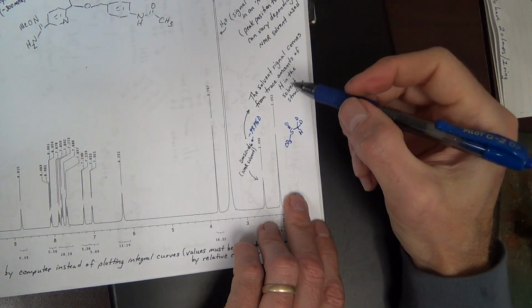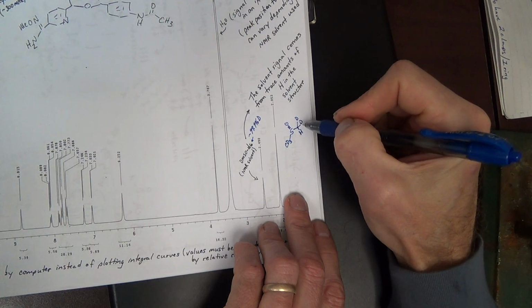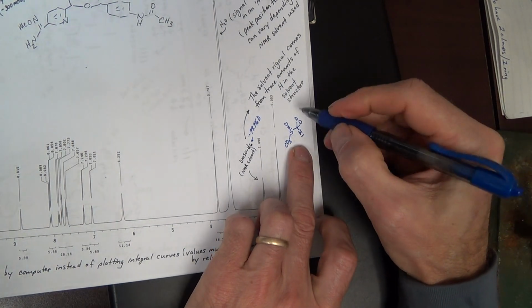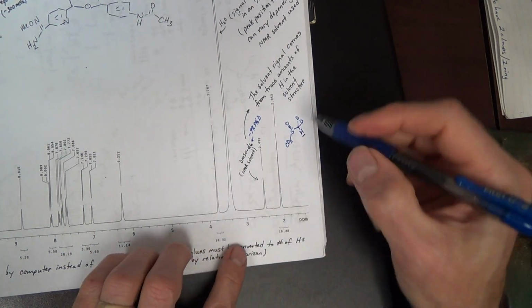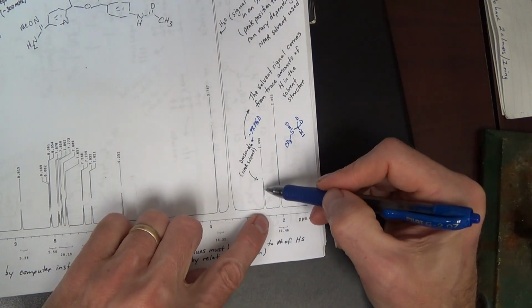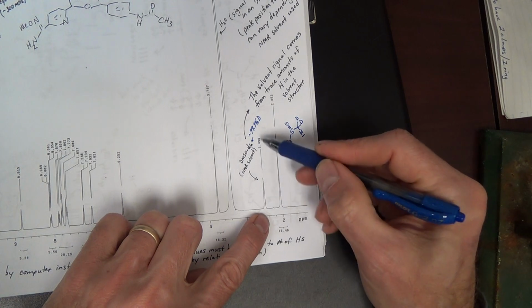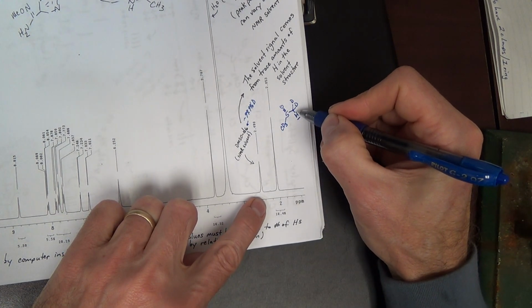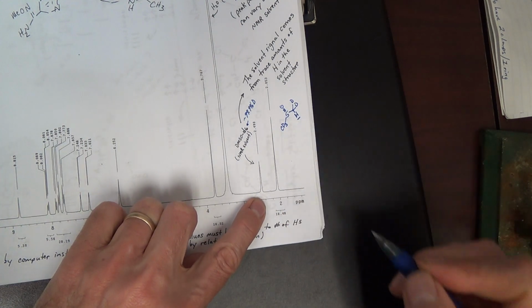Okay? It's not 100% deuterated. And this residual proton that sits here will give you a signal. And that is, when we say the solvent signal, it's really the residual hydrogen in your deuterated solvent that's giving the signal.